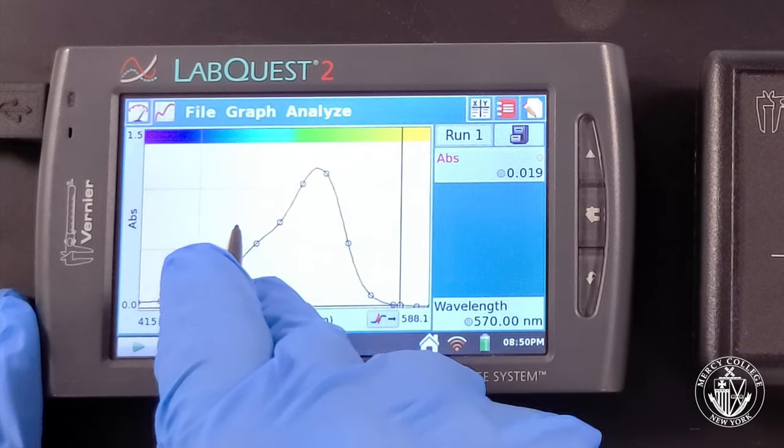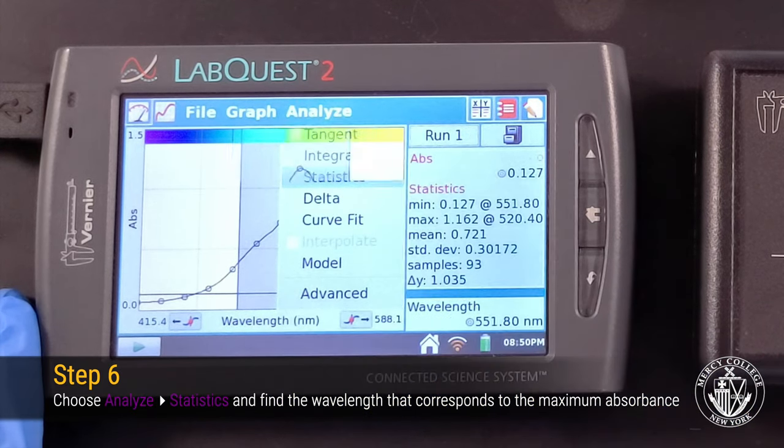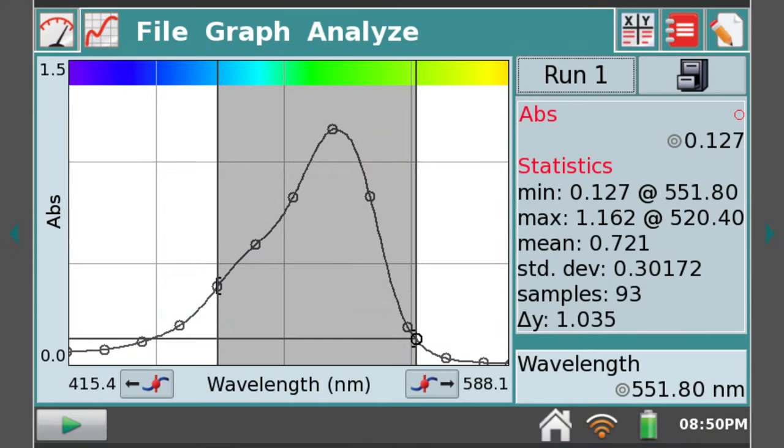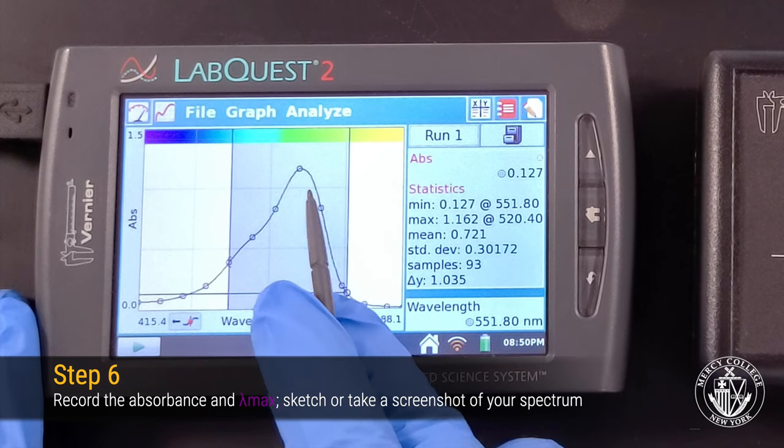To determine the wavelength of maximum absorbance, highlight your data and select Statistics from the Analyze menu. We're looking for the highest point on our absorbance spectrum. In the panel on the right, we can see that this corresponds to a max absorbance of 1.162 at a wavelength of 520.4 nanometers.